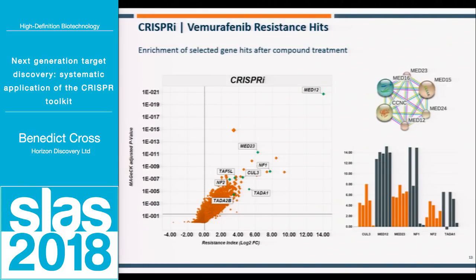And that's exactly what you see with CRISPR knockout technologies, and is exactly why CRISPR is providing so much cleaner data sets than things like shRNA screening. Because what you really want is that high degree of reproducibility in your study so that you can discover with much higher degree of clarity, with better statistics, the real hits that emerge from the rest of the data noise. But you can also see that there's some room for improvement.